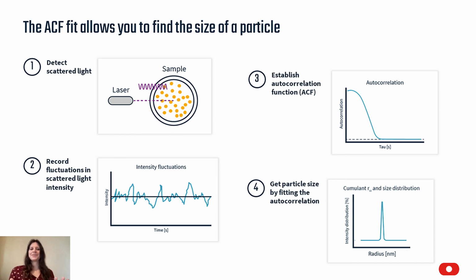Okay, so now speaking of these parameters, you're probably wondering, what does DLS actually tell me? There are two key pieces of information that come out of the data collection: the RH, or hydrodynamic radius, and the PDI, or polydispersity index. Let's discuss the PDI first.